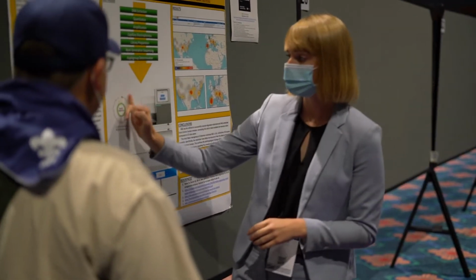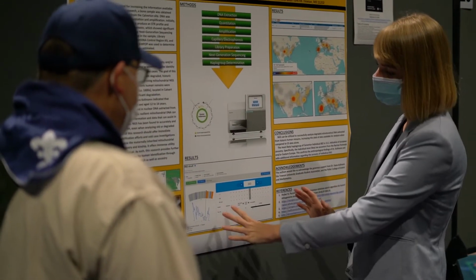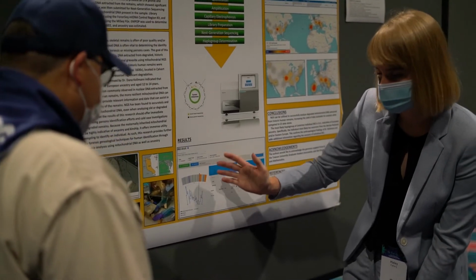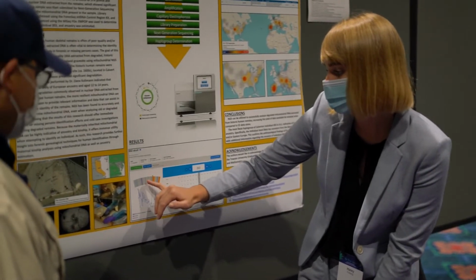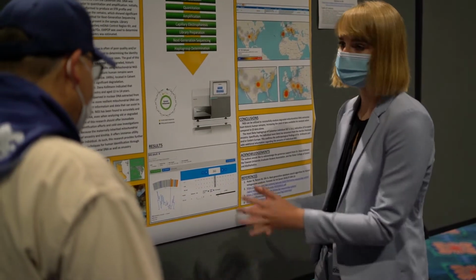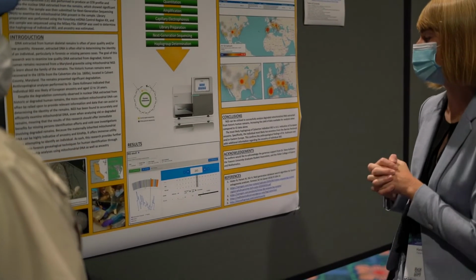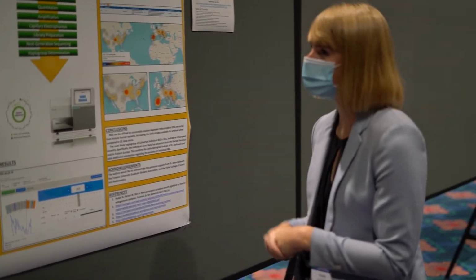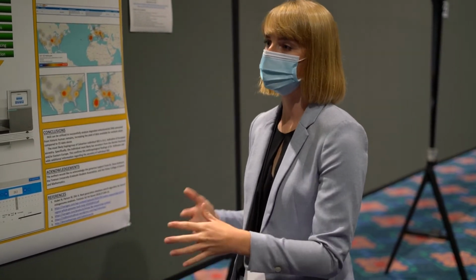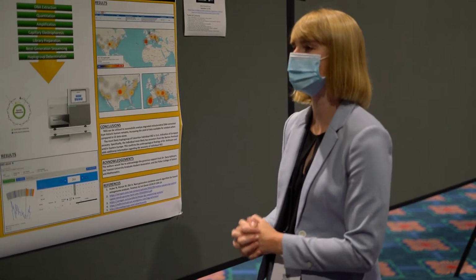Yeah. And we looked at the control region, so just a certain region. Sure. And the cool thing about how you can look at the results is all of this yellow is where there's nothing there because it's so degraded. But any of these blue spots is where it's different from the control sample that they compare against everybody. So there's definitely some differences, which was what allowed us to figure out the haplogroup. That was really awesome. Mito is really cool because we could figure out ancestry. If we had a bunch of samples, if we look into some of the other remains, we could try to figure out if they're related maternally and potentially figure out their kinship. That would be really interesting further on.